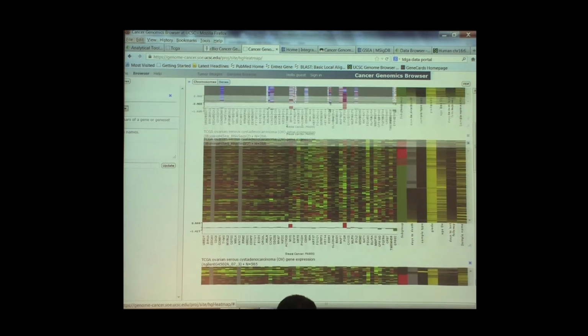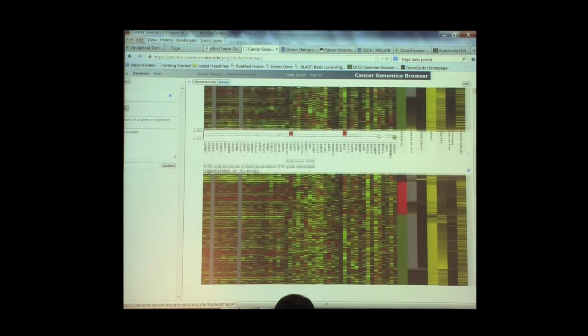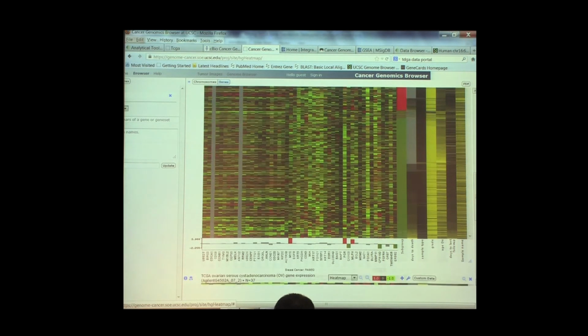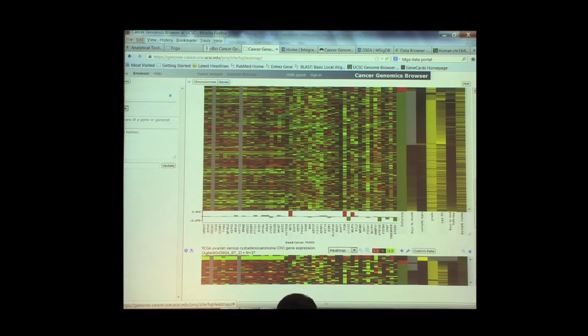But why might you not see it in, say, the RNA-Seq data, but we see it being grouped with this subgroup? No, that's not what I wanted. So the green, these tell you where it's enriched, where you're actually seeing a significant difference.